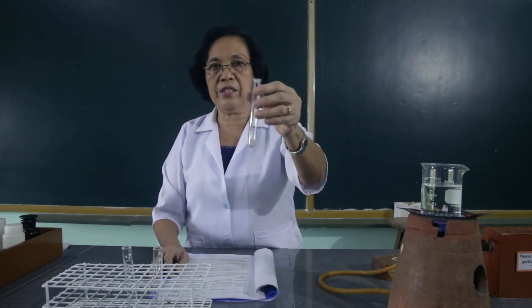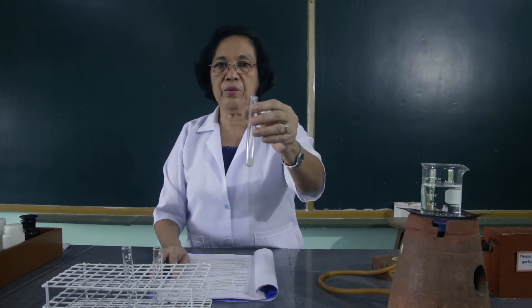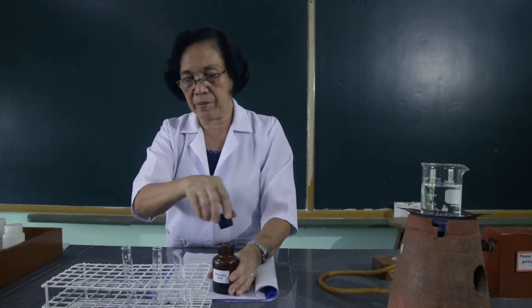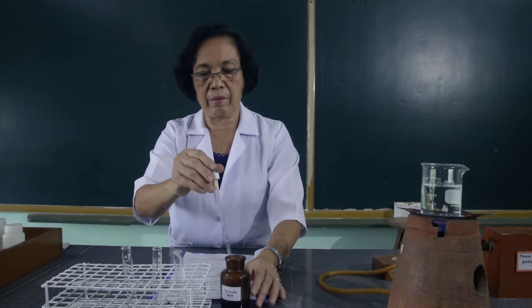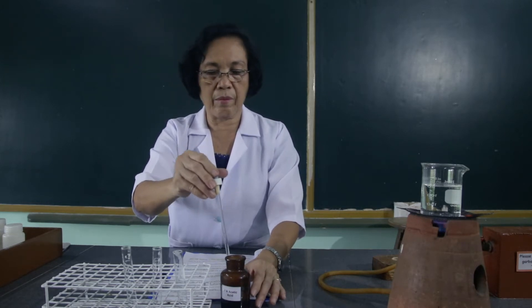Then to the first test tube, we are going to add 1 drop of the 0.1 normal acetic acid. So this is the 0.1 normal acetic acid. Just 1 drop.